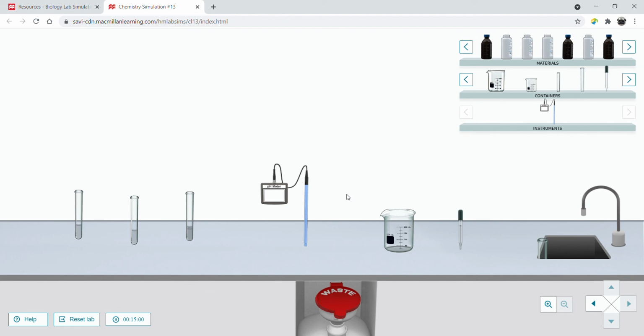Okay, now what we're going to do is take the pH, and you want to write this in the 3rd column. Wow, that started at 7 and went down to 2.71. That is your negative control. That is your water. That's your control.